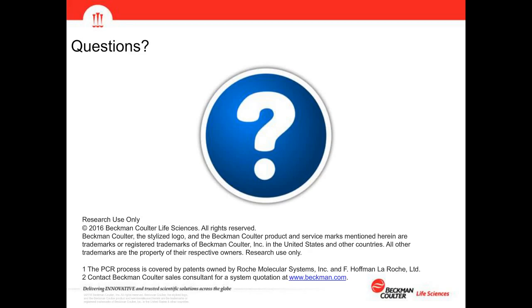Okay, Dr. Overkamp, our first question is, accurate pipetting is important to all liquid handling tasks. How does Beckman address this, and how complex is it for the user to handle? Does it require scripting?